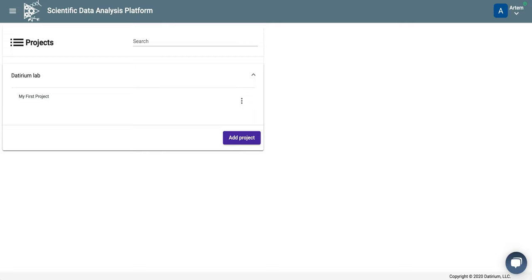Overall, it works exactly the same as adding ChIP-seq data, but you need to make sure that you have the appropriate pipeline.